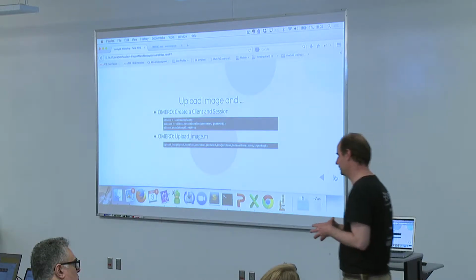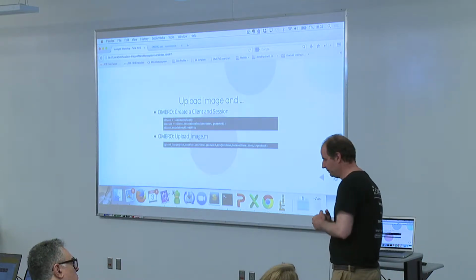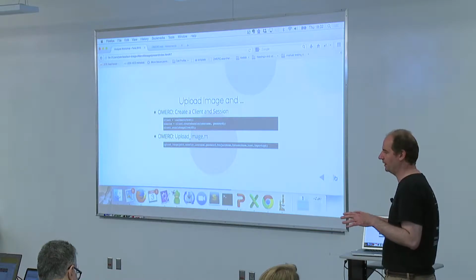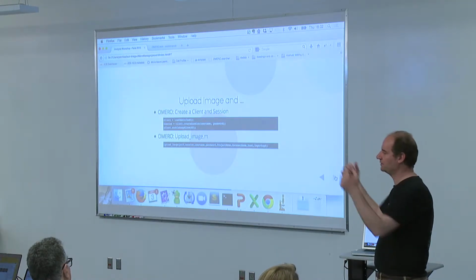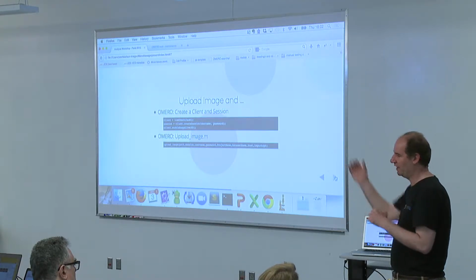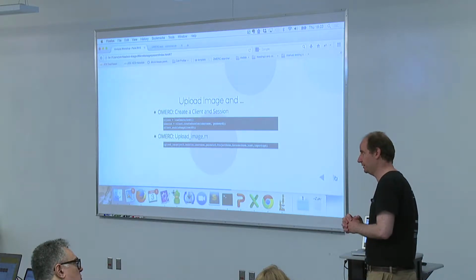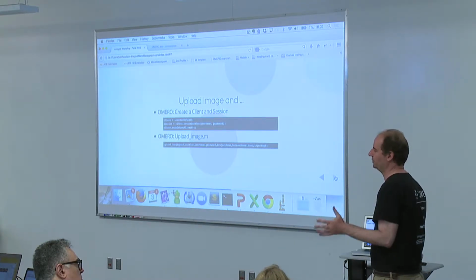In order to enable further development on this front, we are brushing up our utility package, which we call Java Gateway, which will make it easier to communicate with our Java API, and then create small, more lightweight components for, let's say, ImageJ plugins, just like a tree viewer. You saw that our ImageJ plugin is basically a repetition of the quite heavyweight OMERO Insight. Now, a lot of things are simply bundled into OMERO Insight. We are basically taking the things apart, decoupling them, so that any developer can take a part of OMERO Insight, just like the tree viewer, and have just the tree viewer in his plugin, which is connecting to the server and viewing the images and doing whatever he likes with them, because, of course, the image analysis demands are quite heterogeneous. And it uses simply the tools which we have already, but we just need to partition them nicely and put them out.